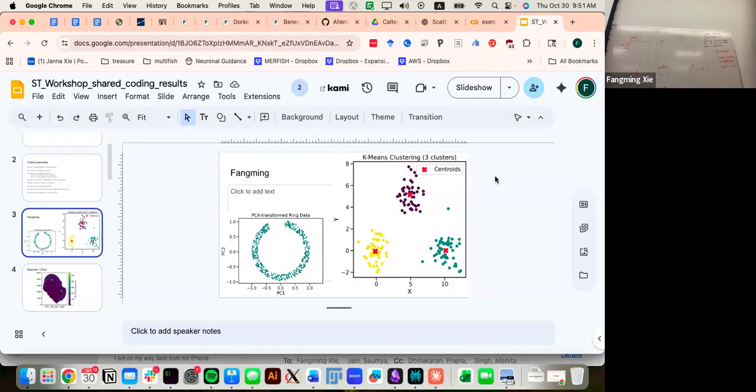Hierarchical clustering is a hierarchy of trees. There are simple ways to do hierarchical: you're given a set of data, you start from the ground up and compare which are the most similar. I think Talon is more sophisticated, in the sense that they first divided cells into a few major groups. That's the first layer of hierarchy.